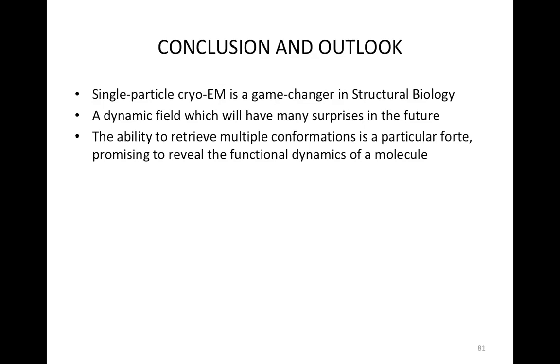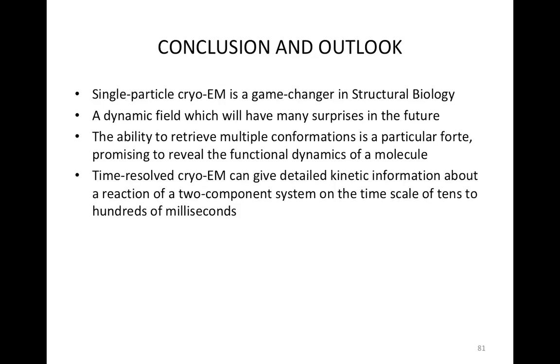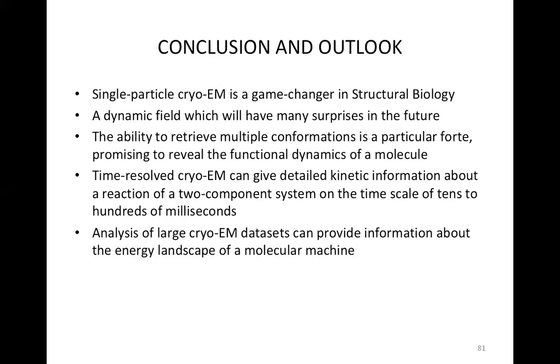The ability to retrieve multiple conformations is a particular forte, promising to reveal the functional dynamics of a molecule. And time-resolved cryo-EM can give detailed kinetic information about a reaction of a two-component system on the time scale of tens to hundreds of milliseconds. And the analysis of large cryo-EM datasets can provide information about the energy landscape of a molecular machine.